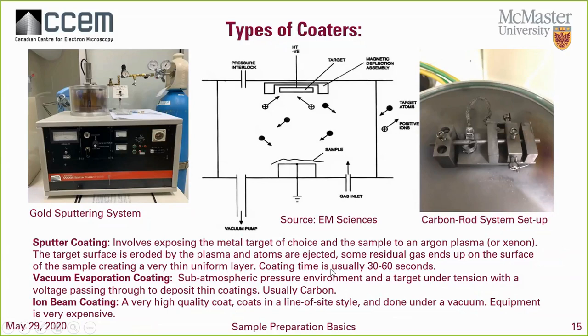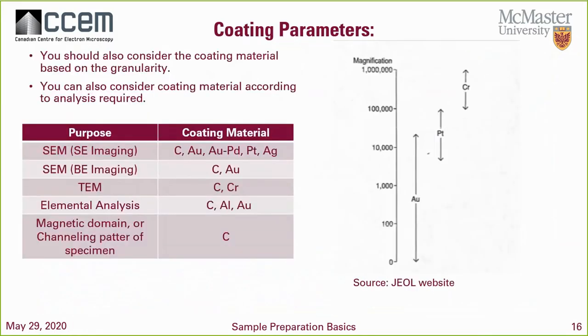Okay. Now, if you want extra help with these coaters, I recommend everyone add a thickness monitor to these, because that way it will give you a much better understanding of why coatings are important, which is my next slide, right? Because we want to coat in terms of granularity as well, right? We want to make sure that we only put in the amount of coating that we really require, okay? So this little table here on your left, right, will give you some coating ideas.